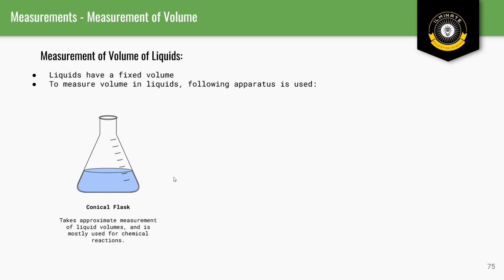So whenever you're, for example, doing a titration of an acid and alkali, whatever that is, I don't know the exact pronunciation of that word, but you get the point. The conical flask is mostly used for measuring the rates of reaction, as well as other reactions such as the titration, in which we react an acid and a base. And basically for reacting literally any substance, we use a conical flask because that prevents any of the reactants inside or the products from getting out, and that helps us preserve the amount of mass and volume inside.